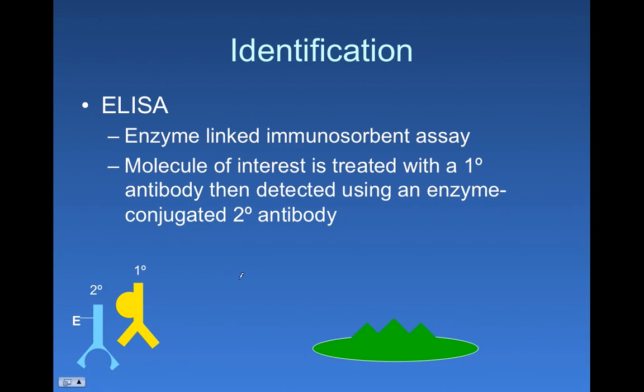And then we're going to treat those patient samples with what we're going to call the primary antibody, the rabbit antibody that can react against Ebola protein. Now, if a patient has the Ebola protein, when that primary antibody interacts with the piece of paper, it will find the Ebola protein and the variable region will bind to it.